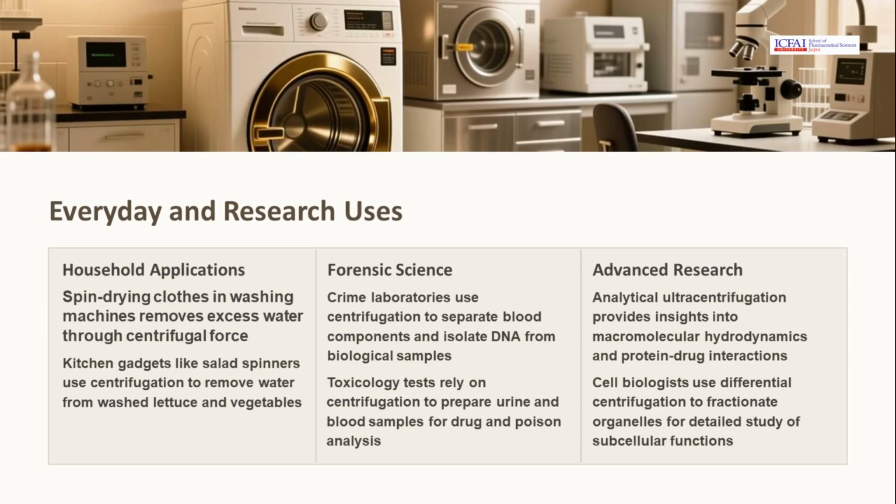From spin-drying clothes to forensic science and advanced research, it offers insights into macromolecular hydrodynamics and protein-drug interactions. Its versatility extends to household gadgets and scientific laboratories, showcasing its wide-ranging utility.